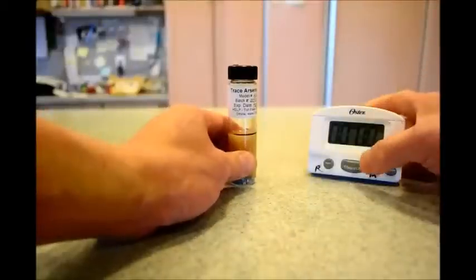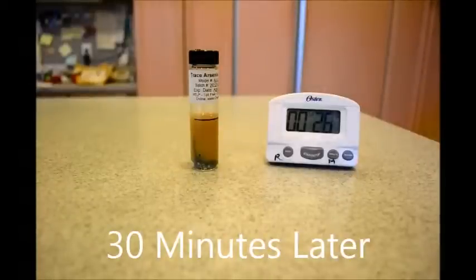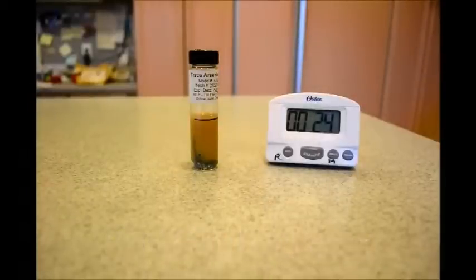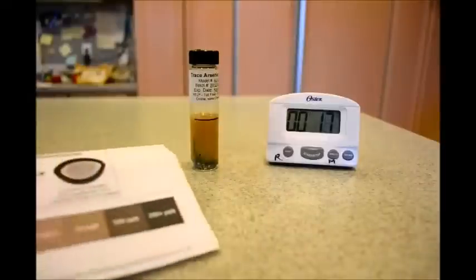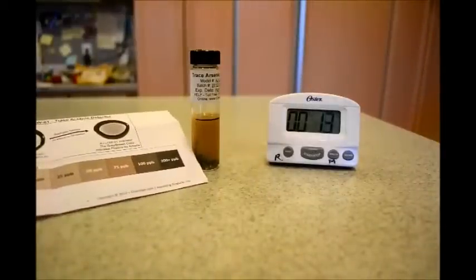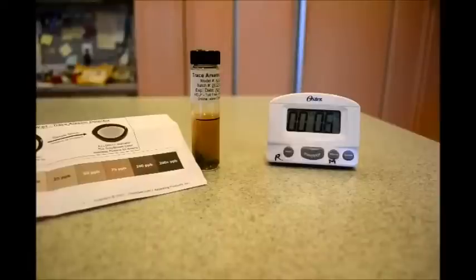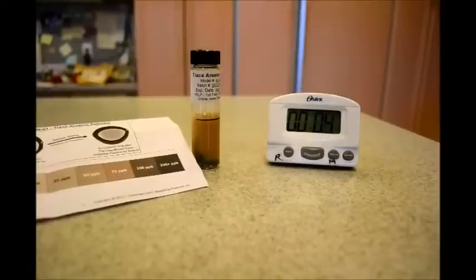We'll wait for 30 minutes. We are now almost half an hour and almost time to check the results. I've pulled up the instructions chart to see whether there is any presence of arsenic that the detector has detected or not. We will be seeing shortly whether there is arsenic in baby food.